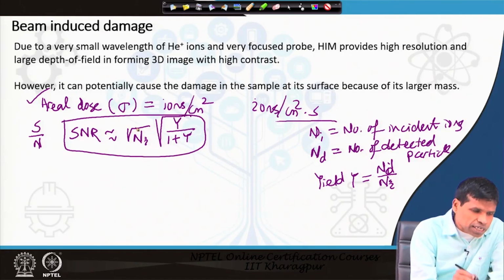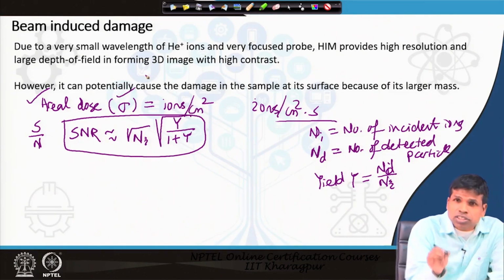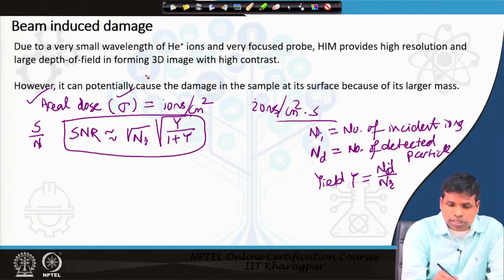And then this areal dose also depends on the area on which the ion beam is striking.